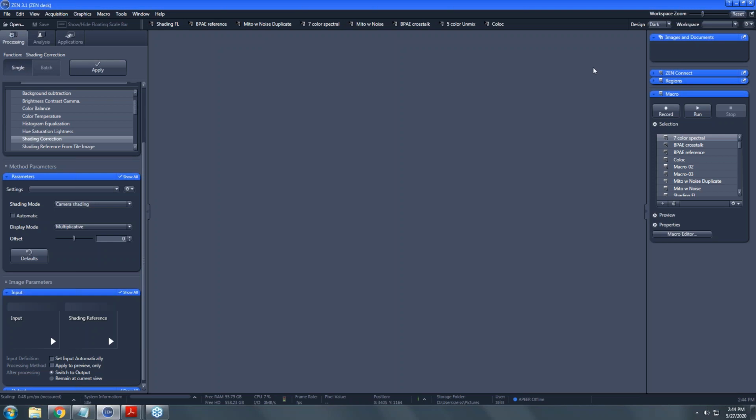So we did those first 3 based on questions that we had last time. But the whole theme of the Explore ZEN idea is that we want to expose people who are attending this to parts of ZEN that we wouldn't usually be talking about because they're not commonly asked for, but maybe there's some real value to them. They're just, people don't know to ask, or they're just not related directly to instruments that we're usually working with. In this case, we're going to look at ZEN Connect, which is a relatively new module. So it's not that we don't show it to people. It's just something that hasn't been around for very long.